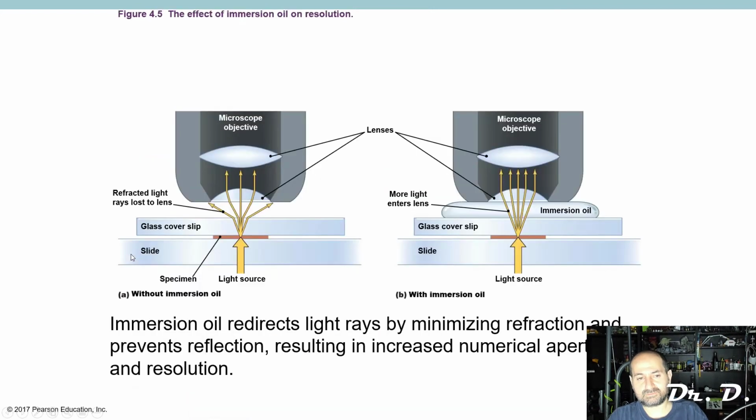You'd see the image. So again, here is your oil lens, and here's your specimen. Light comes in through the specimen into the lens, and then you see the specimen under the microscope. But do you remember with the oil lens, don't we add some immersion oil to that? Why do you think we add immersion oil for the oil lens? Well, remember what I told you.